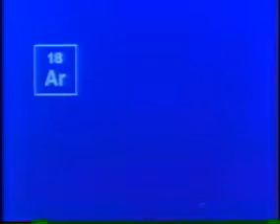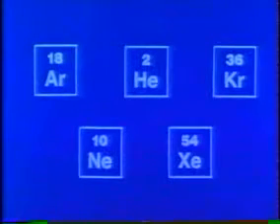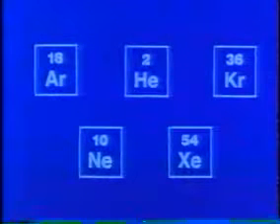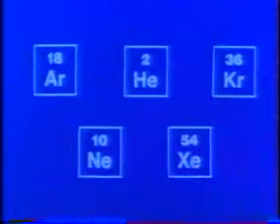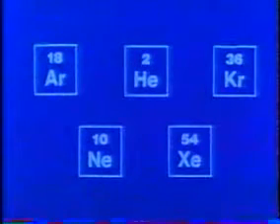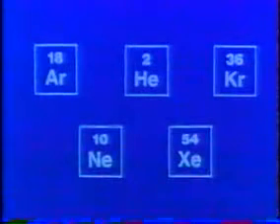The lithium melts, but argon does not react. Argon, helium, krypton, neon, and xenon give identical non-reactive results with lithium. We might tentatively classify these 5 apparently inert gases as a family of chemical elements. For almost 100 years, they were called the inert gases.